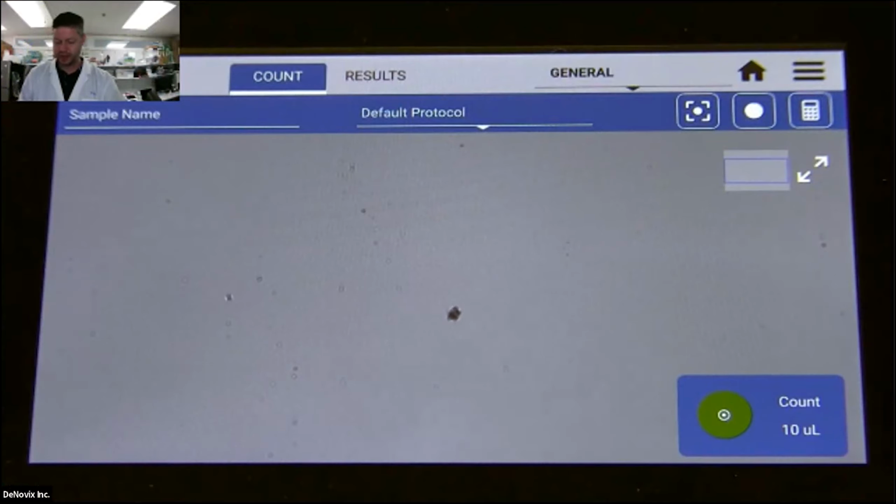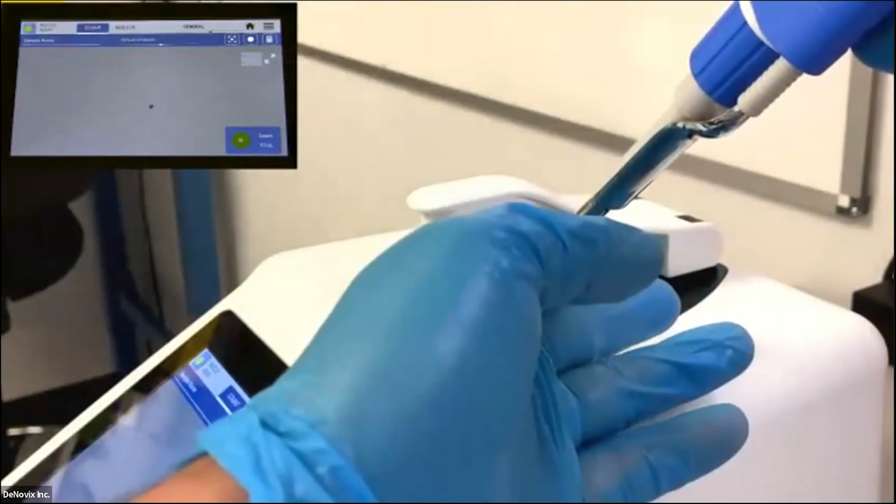Normal, we get it all the time. And when I load the nuclei sample, you'll see that it won't be counted by the algorithm. So you don't have to worry about getting the surfaces completely clean every time. Because there's a good chance that that's just going to get flushed away, but if not, it won't get counted.